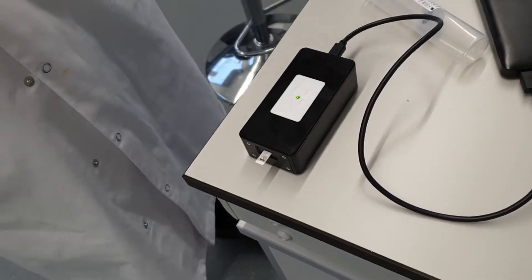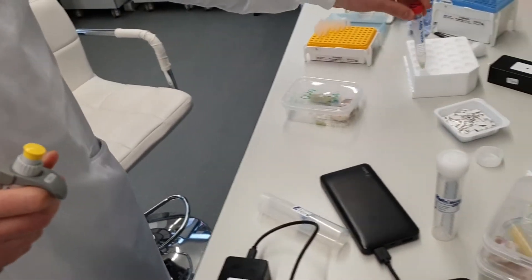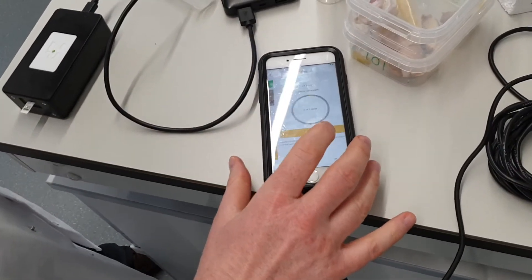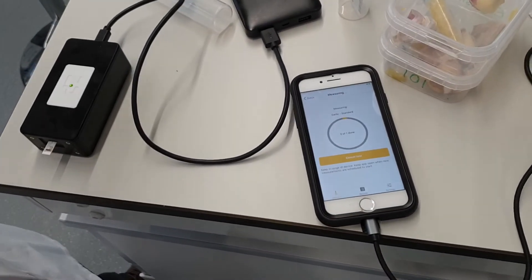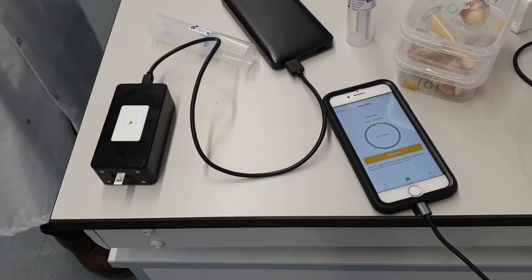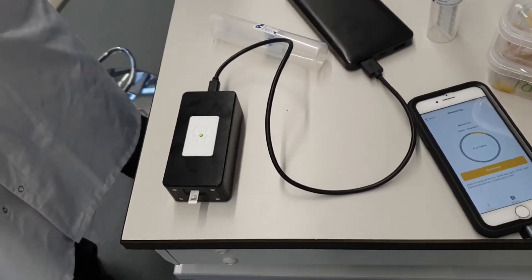We've done that. Now I'll go to the app and tap Measure. The app is now measuring — this will take about 60 seconds to go around.